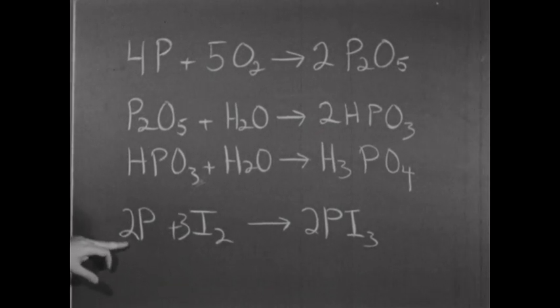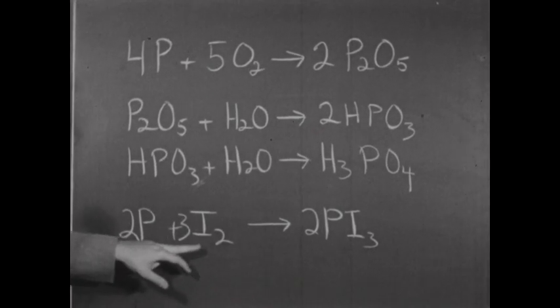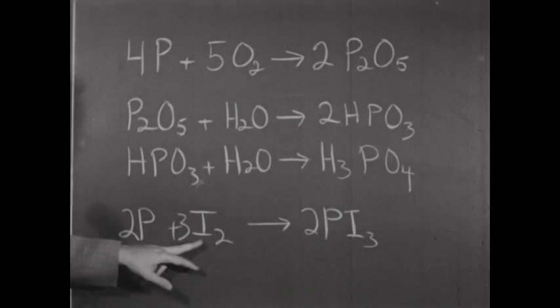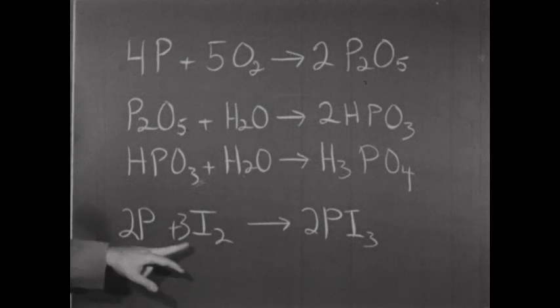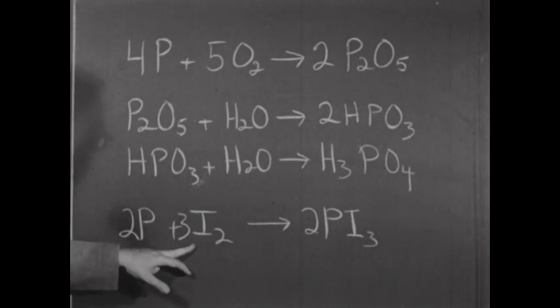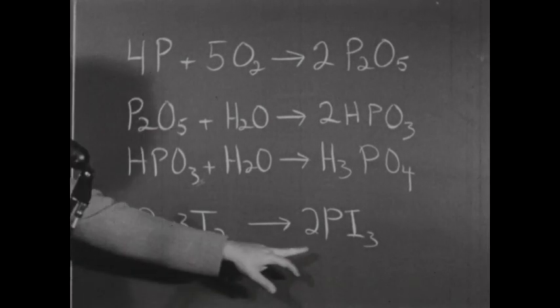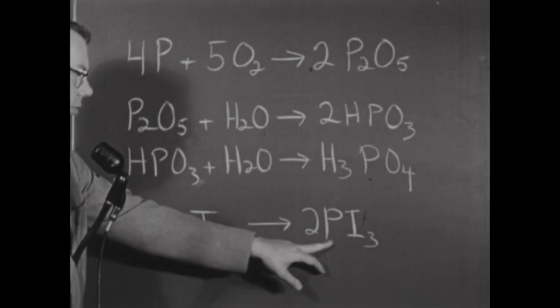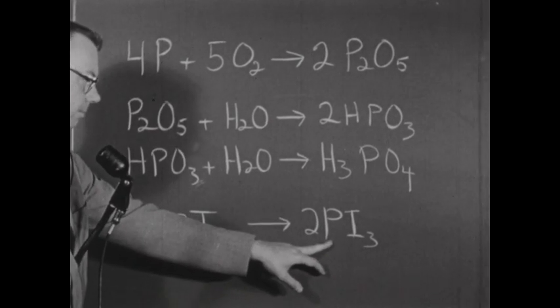When a small piece of phosphorus was treated with crystals of iodine, a rapid reaction took place with the production of phosphorus triiodide.